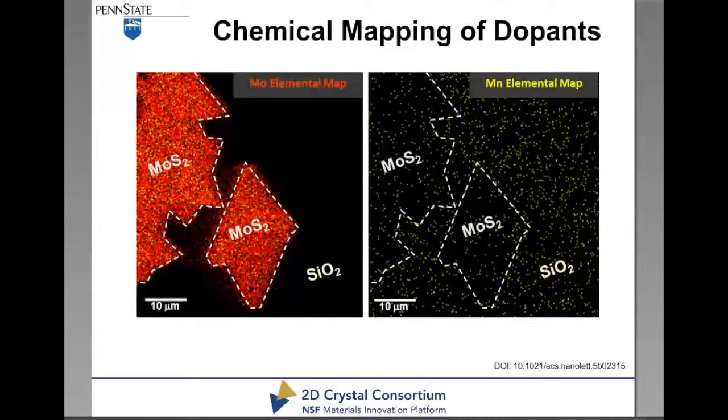The STM itself was done in UHV. So it's a clean surface in the sense that when they put it into the system, they heat it to about 400 C or so to desorb any adsorbates, and then they do the STM-STS in a UHV system. We'll have those capabilities here as well, in situ, for 2DCC for the MBE-grown materials. It actually will never have to leave vacuum. It can be transferred directly over to a four-probe STM system.